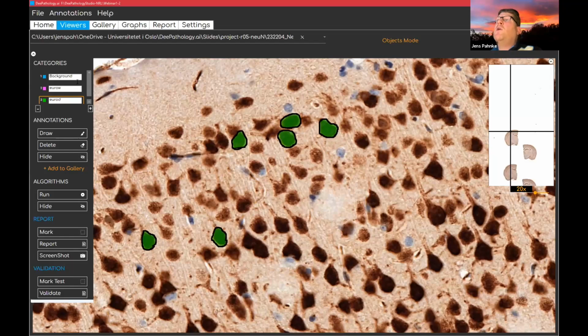So now we have 6 objects. Now we take the little bit lighter ones. Let's take one of those here. They appear with a different color then, violet or green. And I, of course, can add other objects here, like cells that are not stained, like this here.